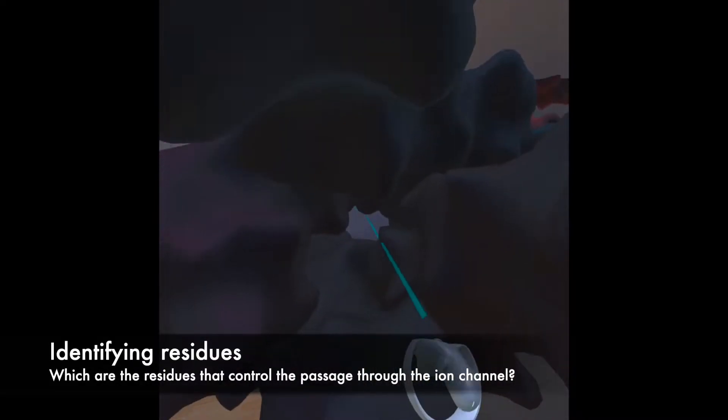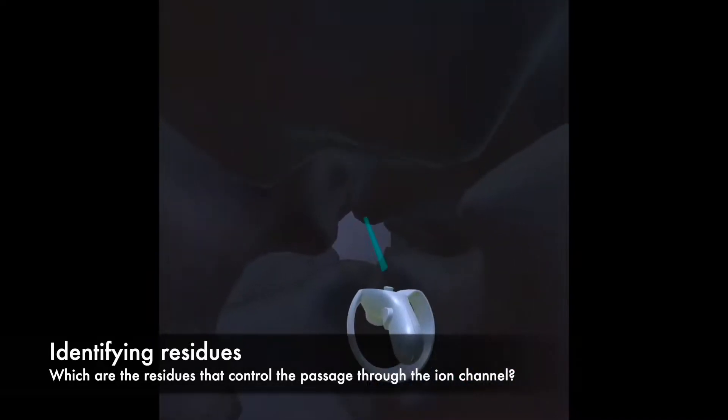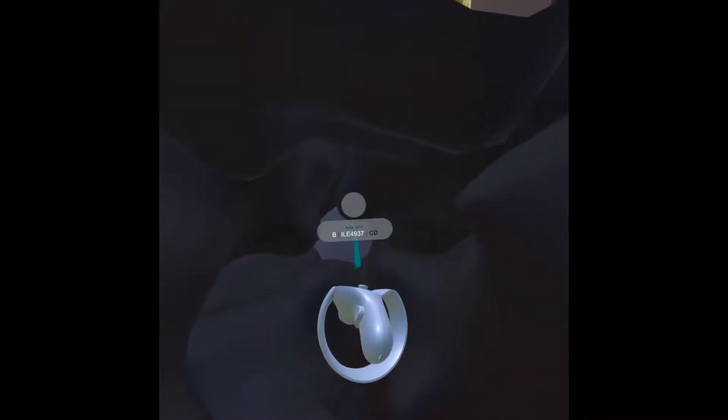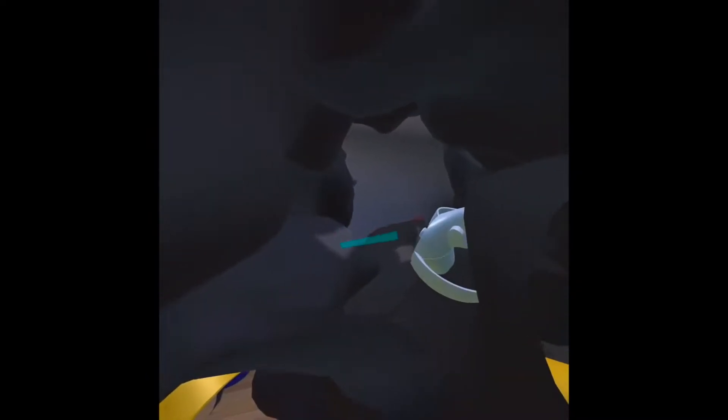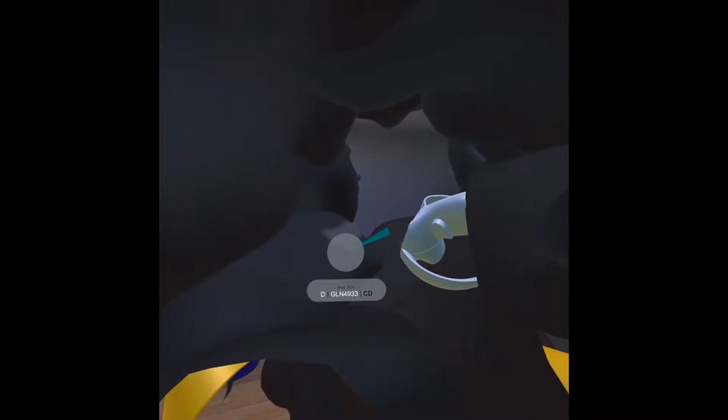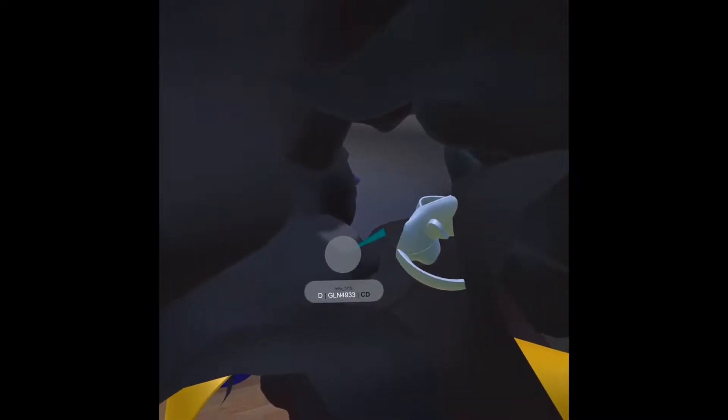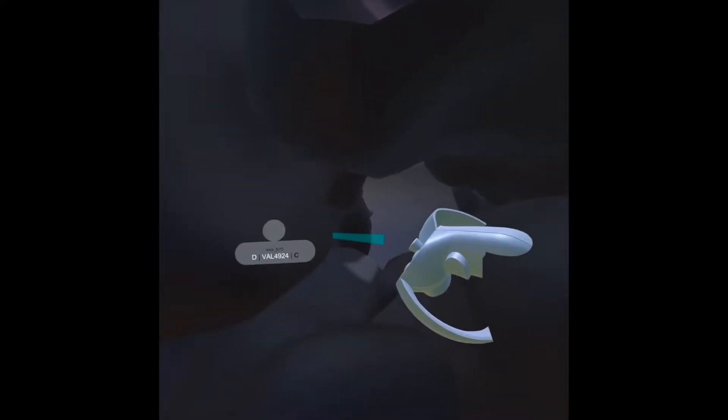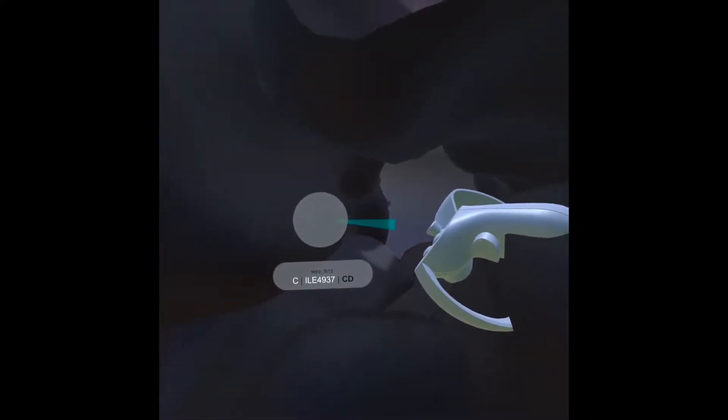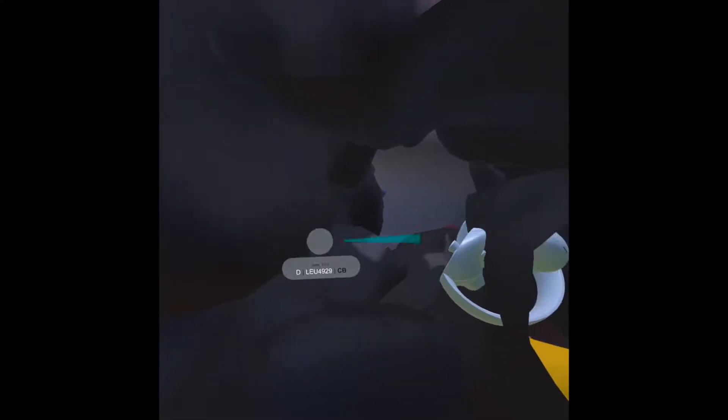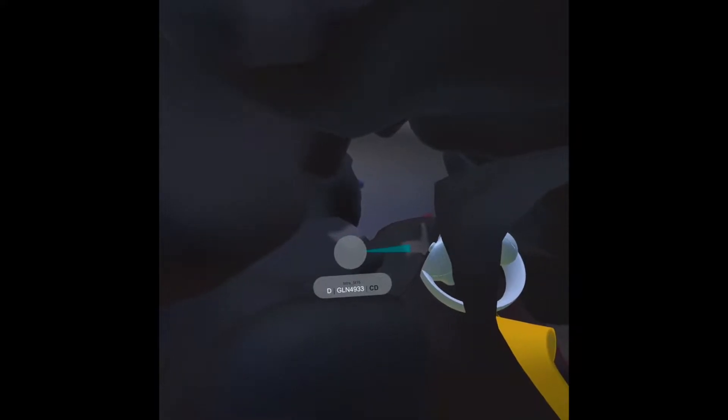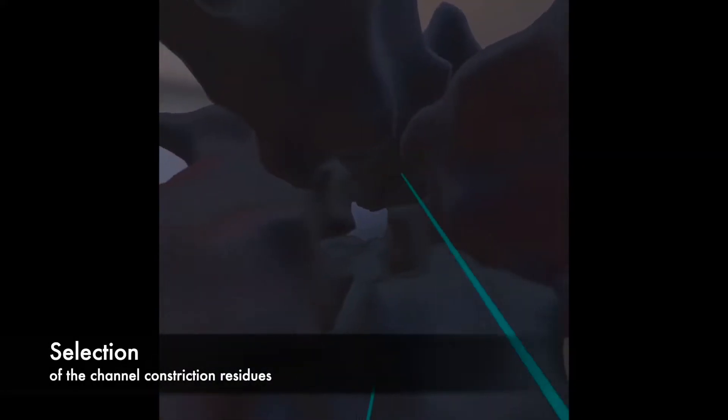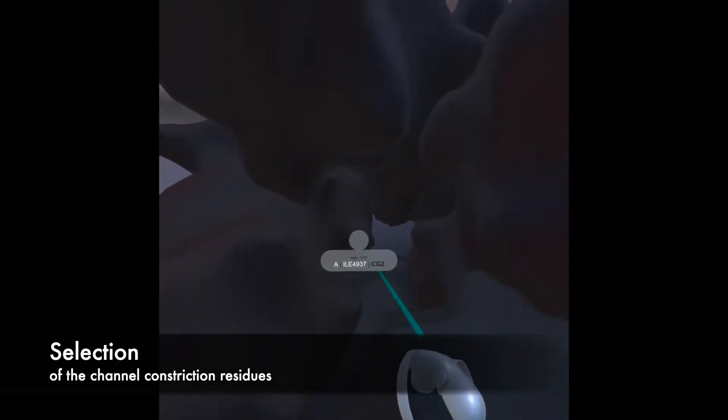So this is an aspartate. Here it's an isoleucine. And now if you go down here what do we have? We have a glutamine, sorry. So that's one of the critical residues. And I think there's an isoleucine, here. See isoleucine and a glutamate. You can see they kind of really twirl around here, the pore.